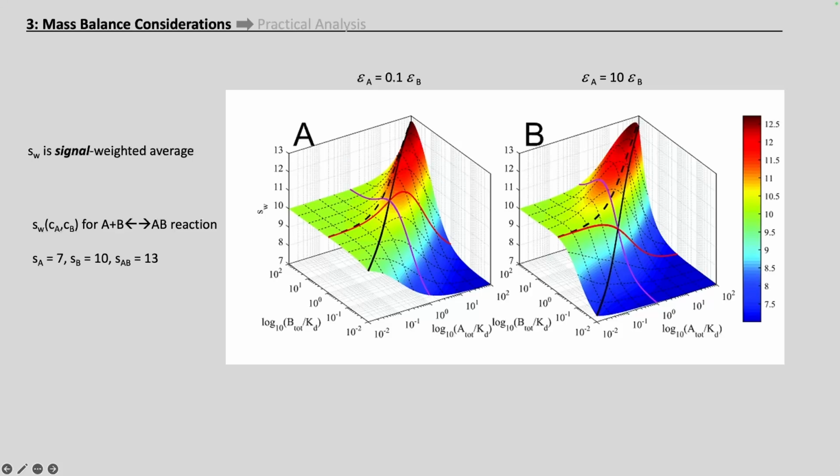As a teaser, I will tell you that there is a specific path, the dashed line here, where these two isotherms are the same. Actually, these are concentration combinations where the system sediments as a single boundary. And this is a segue to the physics of the boundary structure.